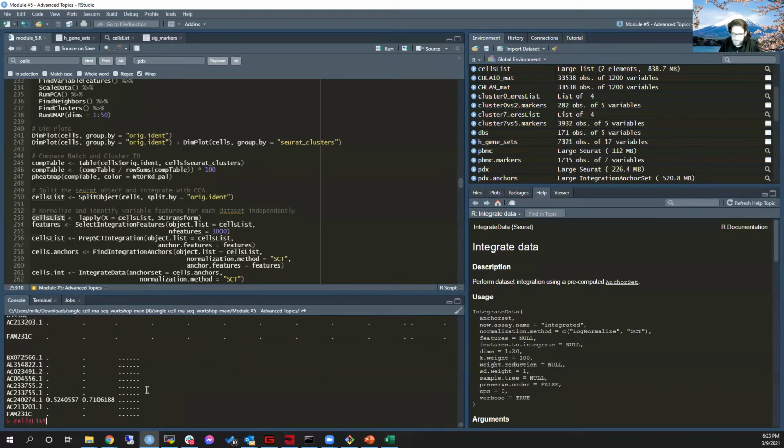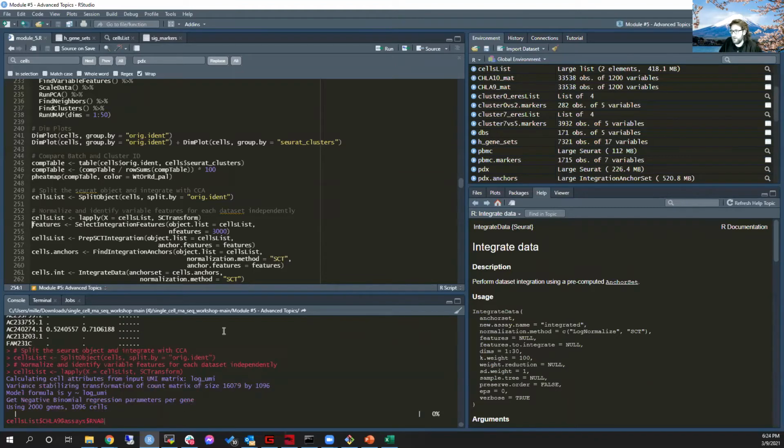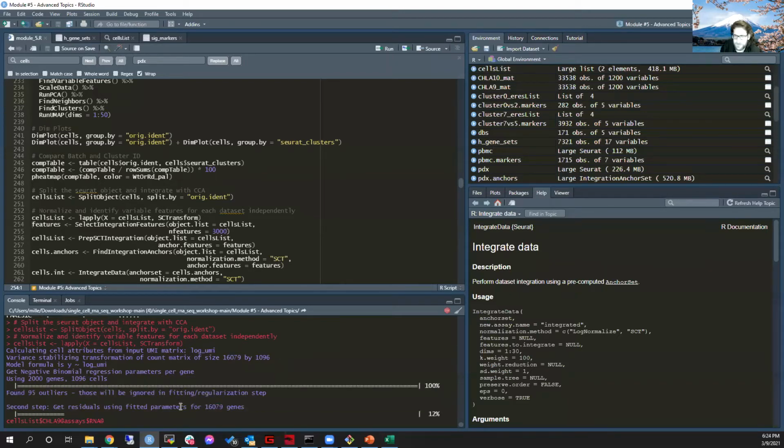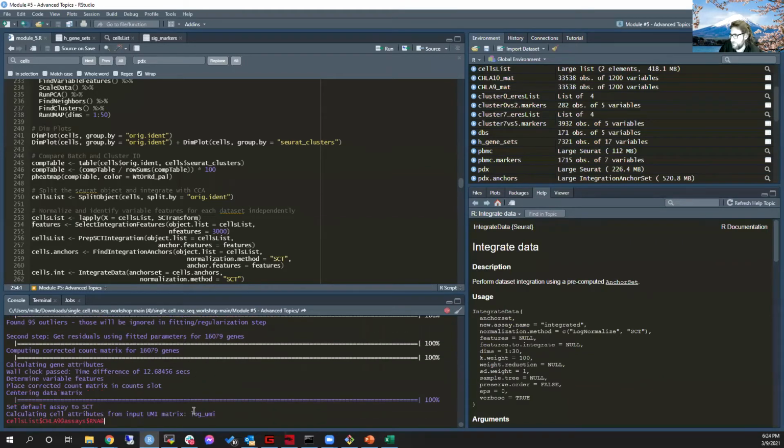So let's recap that here. So we just do our split objects. We run this. So by the time it gets to here, or sorry, that's my bad. By the time it gets to here, which I guess I probably didn't need to run again. My bad. It's already down to 16,000 or 18,000. Sorry.